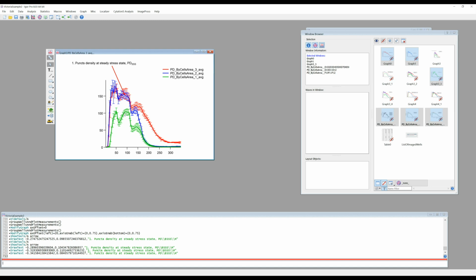Now, you can average the value from this window, or you can just choose one specific time point for simplicity's sake and let that be the 100-minute time point value in this case. Now, why this time window? Because this time window is not only free of these wash step artifacts, it is also more reliable compared to the max value we could potentially use.